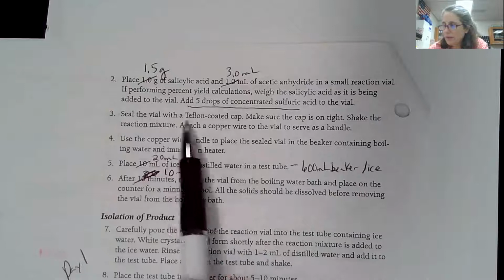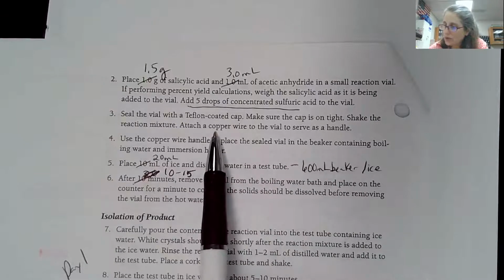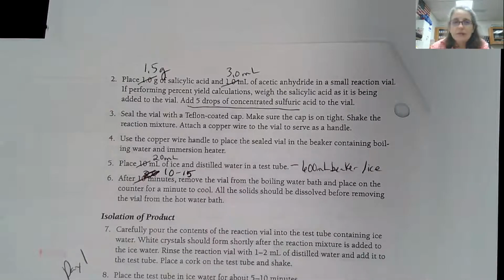We're going to put the cap on it, and then we're going to make sure it mixes, and then we're going to use a piece of copper wire, and you will see this in the video, to essentially hang the vial into the boiling water.